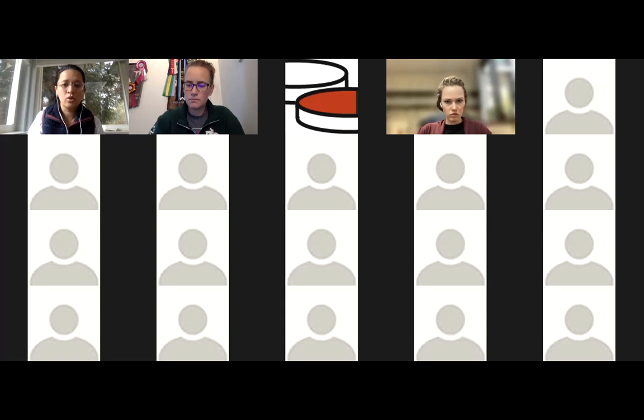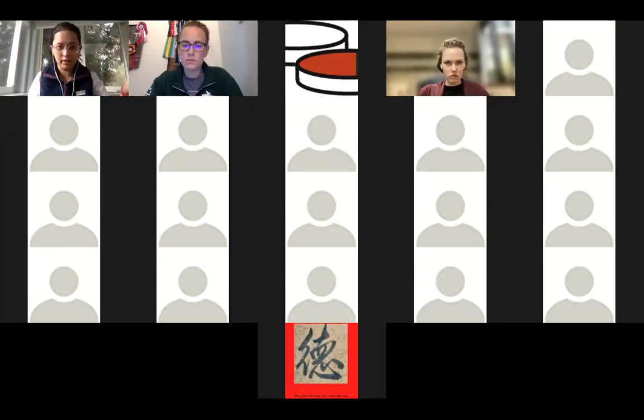Right. So basically, the matrix file that has all your counts will have the cell barcodes. The number of lines in your barcode file should be equal to the number of columns in your matrix file, otherwise you're going to have a clash saying there are more cells in this file and not enough in your matrix. So the number of rows in your gene and cell files, which are the TSV or text files, have to match the rows and columns within the matrix, which you can check also. And there is no standard for reading in the files. As long as those three files exist, you can make a CDS, and CDS is pretty much the input for most of the tools that are available for single cell analysis.